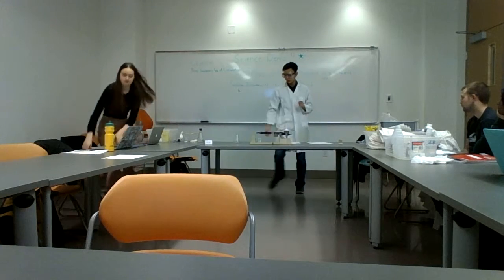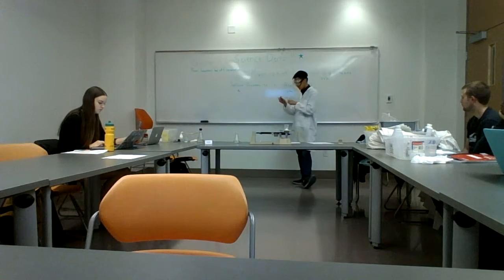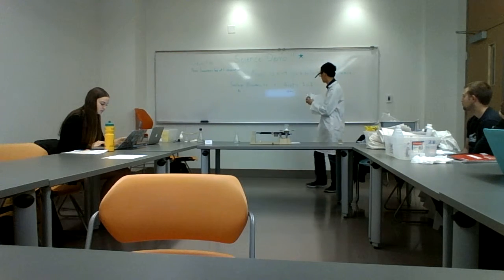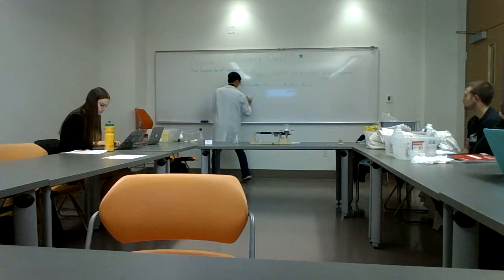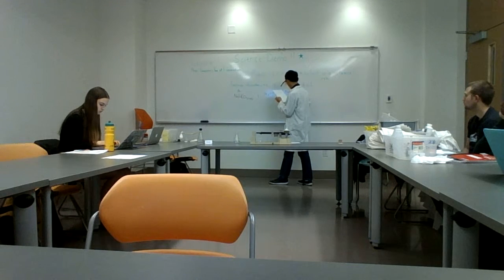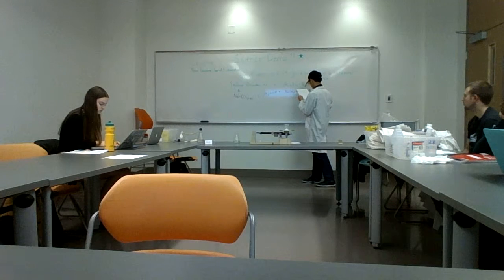And the other thing we have here is 100 milliliters of acetic acid. We're not going to measure that because I already measured it for you guys just to save some time, because we will be a little bit rushed. Okay? So in this reaction, we take 2 of these chemicals and combine them together. I'll write it down as the chemical formula: sodium bicarbonate, which is a solid because it is in the solid state of matter, plus acetic acid, which is this. And what it forms is some sodium acetate and carbonic acid instead.